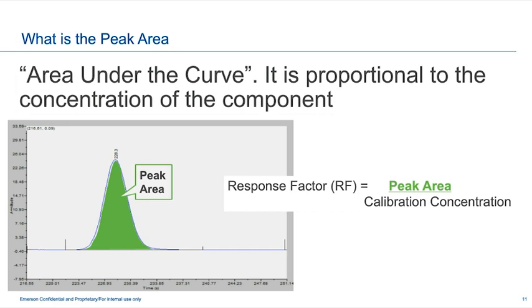But in most cases, we are using peak area. If you have our particular GCs and are using our MON software, whether MON 2020 or MON 2000, the peak area and the peak height information can be found in the raw data table, which is accessed through the component data table or the chromatogram viewer.